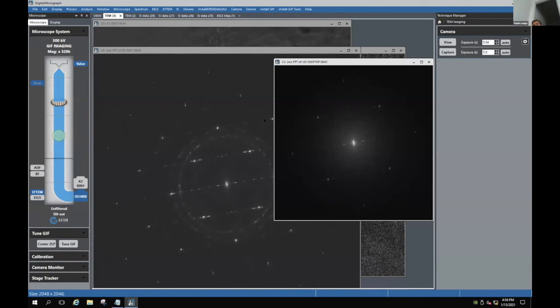But I guess in low dose, low magnification, it's normally easier to achieve these low dose conditions, and you should be able to find certain structure in low dose conditions. Some people, even looking at the image, can tell if the sample is on zone, even in low magnification mode.